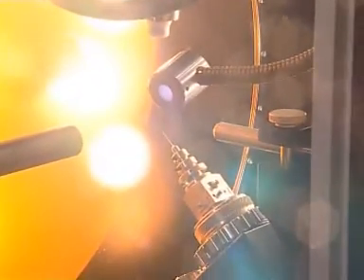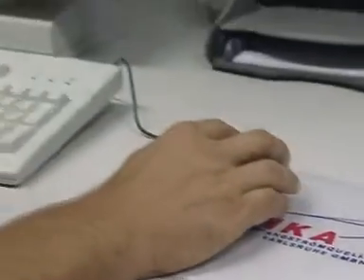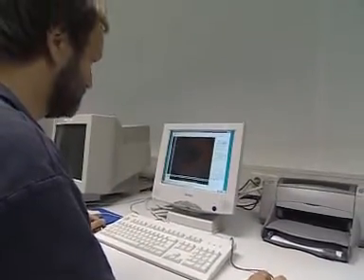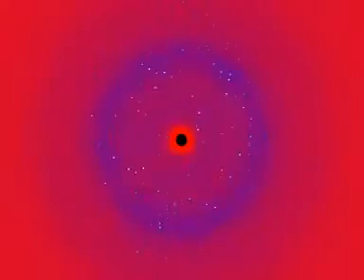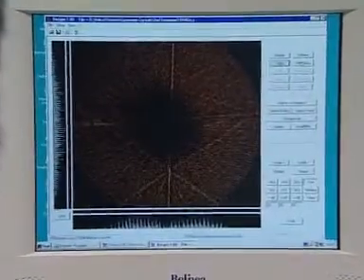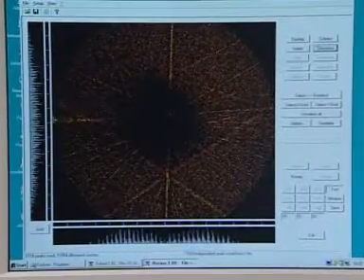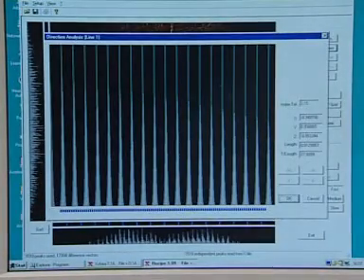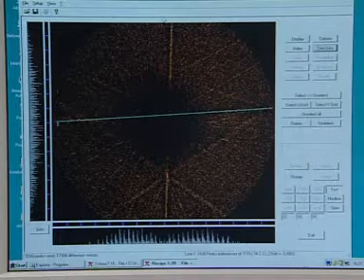In this way, the X-ray diffraction data just collected are to be used to determine the coordinates of the hundreds or thousands of atoms in a unit cell of a protein single crystal, and in this way obtain the complete three-dimensional structure of the protein molecule. Sophisticated computer codes implementing complicated mathematical formalisms support crystallographers in this job. However, this is not sufficient to do the job.